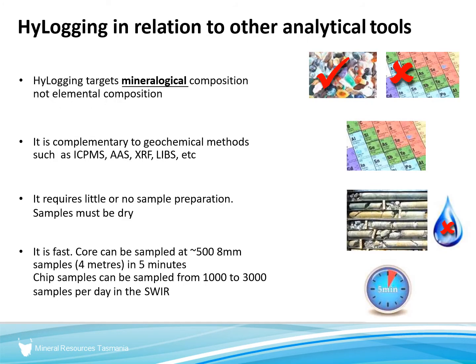The HyLogging targets the mineralogical composition, not elements. So if you want geochemical methods, that's where you go to the XRF. The samples have to be dry. It is fast to scan. It's something like, it would take about 5 minutes to do one tray. You can do sort of like 200 to 500 meters in a day.